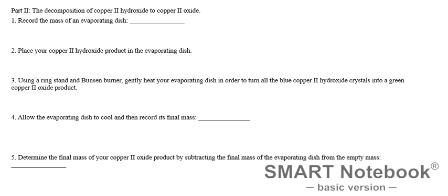This is part two of our copper hydroxide lab. Now we're going to be looking at the decomposition of copper II hydroxide to copper II oxide.